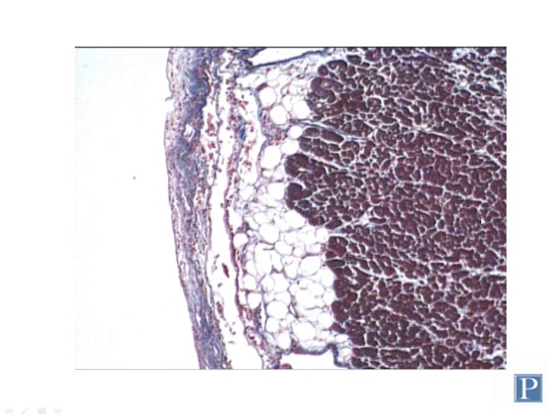Here is the myocardium towards the outside of the heart, and then this layer here is all referred to as the epicardium. The epicardium again has multiple layers here. The outermost or superficialmost layer in this case is mesothelium, another type of simple squamous epithelium, but a type of epithelium that lines the outside surfaces of visceral organs and body cavities.